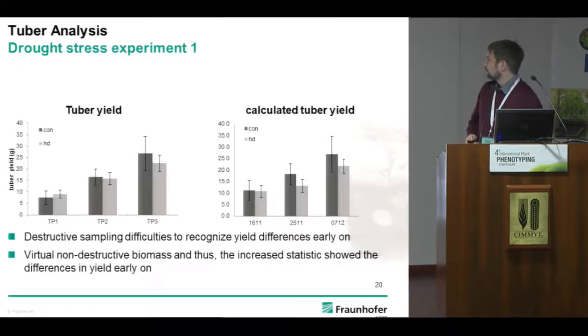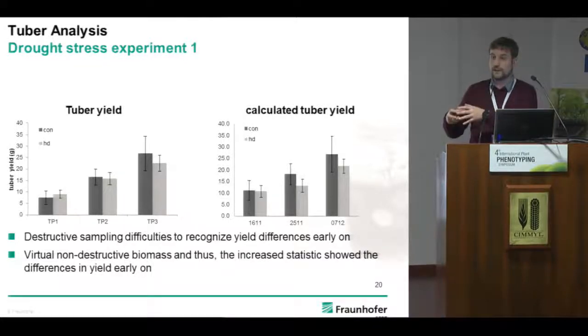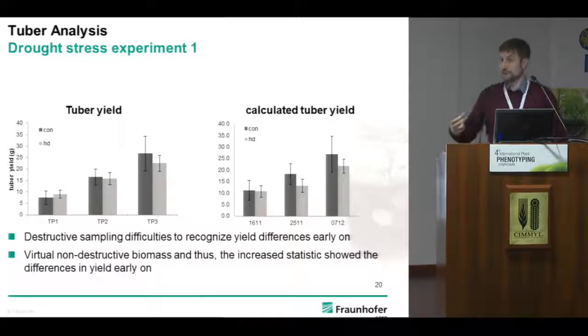So, as mentioned, what we did afterwards was also destructive harvesting. Looking at the destructive harvesting just by numbers, we could see no differences in growth for the tubers harvested manually from the pots. But knowing afterwards there's a really big effect of our chambers, that we have about 1 week's growth advance for the tubers which were later on stressed, we could say, okay, this might explain that within the stress period there's not a big difference between the control measurement and the stressed measurement.